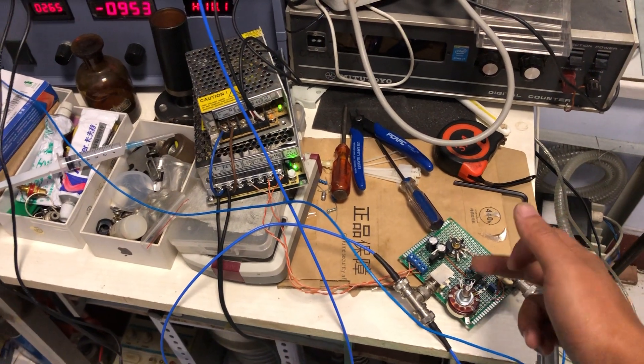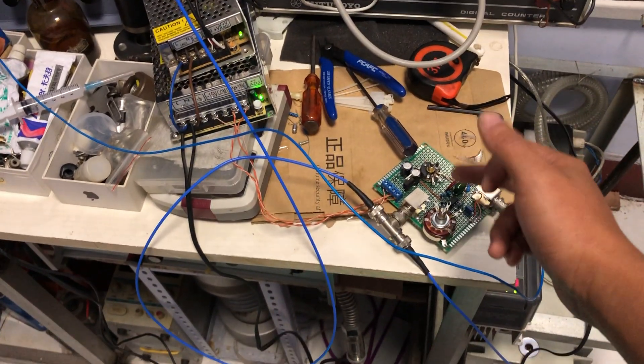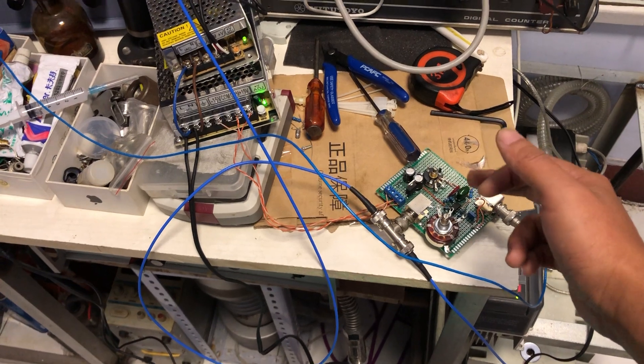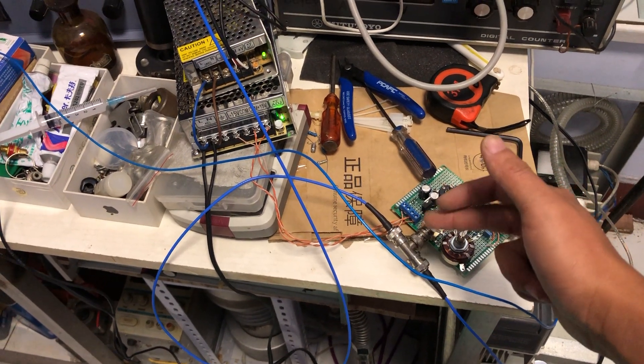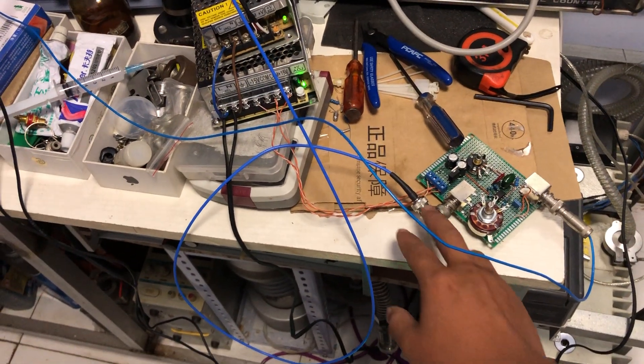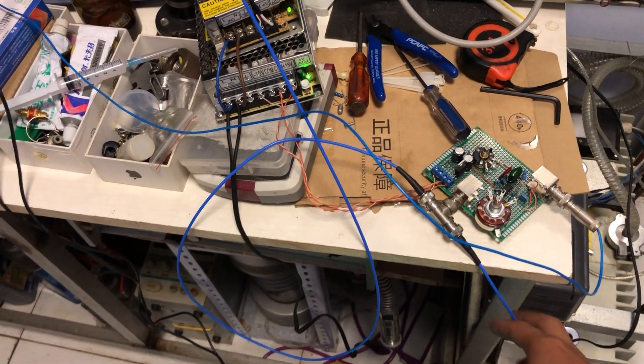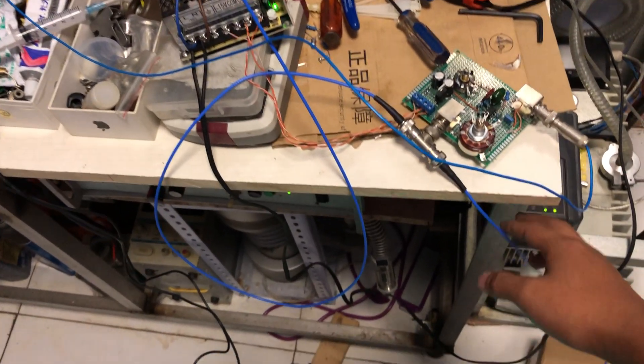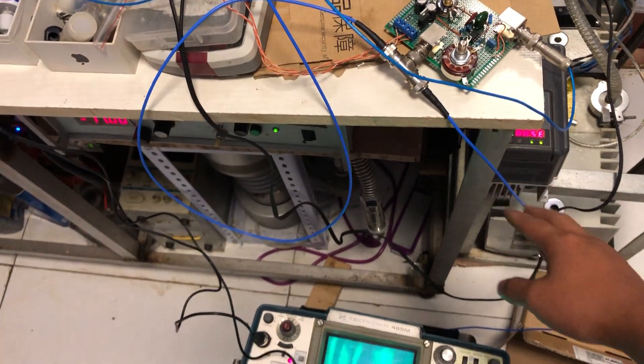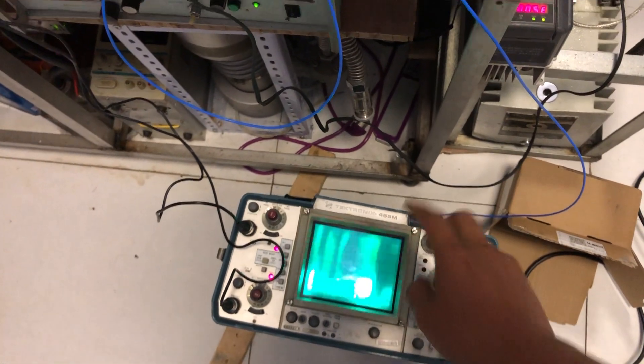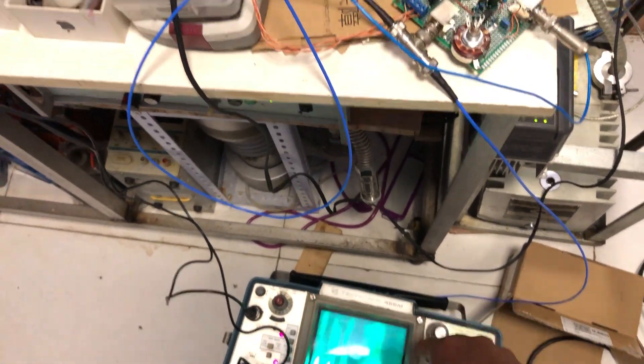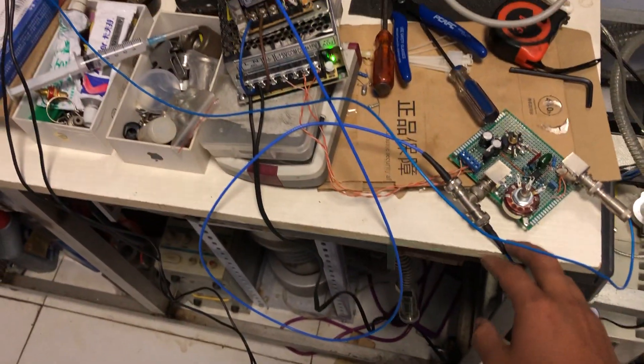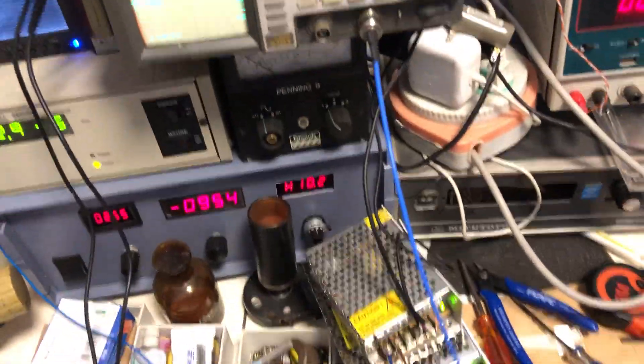And comes through to the speaker in two parts. One of them is coming into the Z-axis input of the oscilloscope and the other one is coming through to this oscilloscope that's monitoring the signal output.